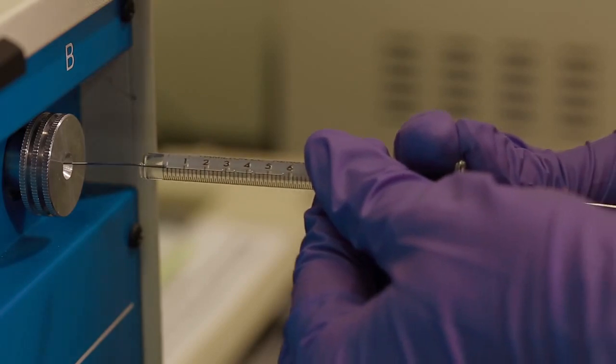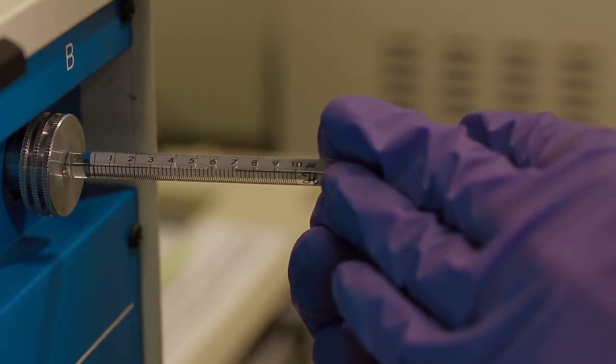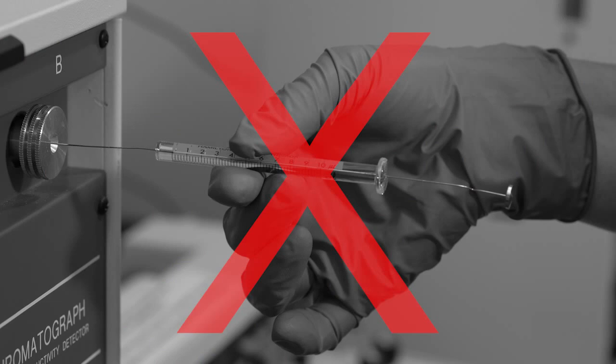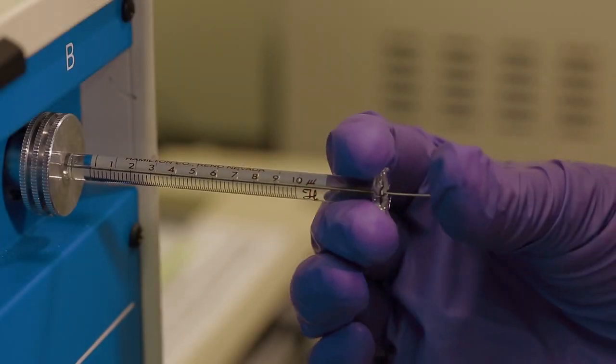You will feel resistance as you insert the syringe. Continue to insert the needle through this resistant material called the septum until the glass is flush with the injection port. Be careful not to bend the syringe. You can now inject your sample into the gas chromatograph.